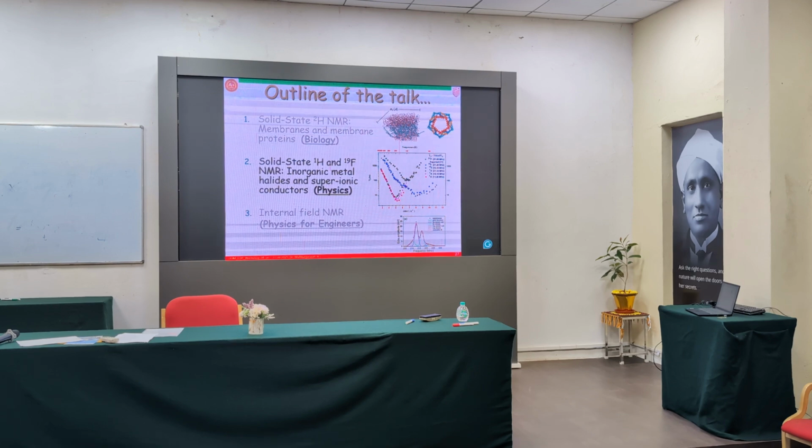That's why, whenever you do a little background verification, this fellow talks differently and what I say is different; that is a major difference. I did not even mention that magic angle NMR. That's why many people work on solid state MAS, magic angle spinning NMR. There is a term called 3 cosine square theta minus 1, the dipolar interaction. Read again: 1 minus 3 cosine square theta.